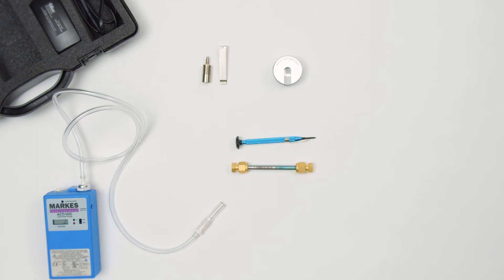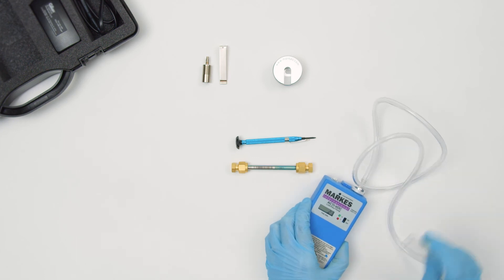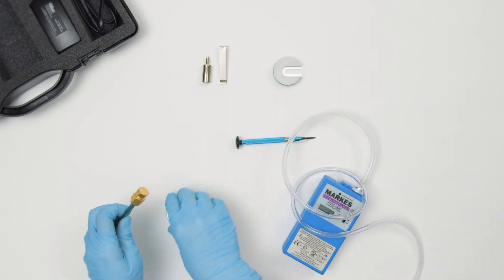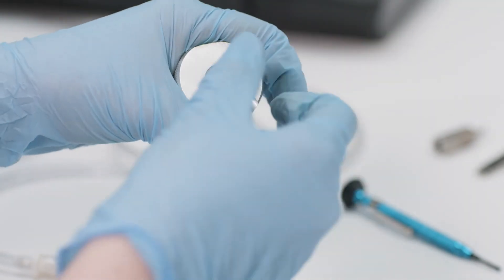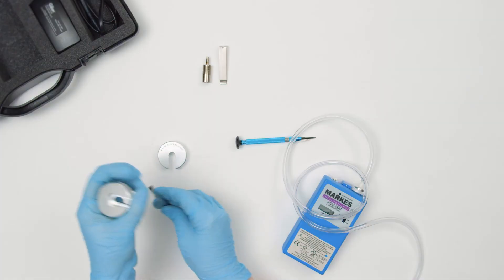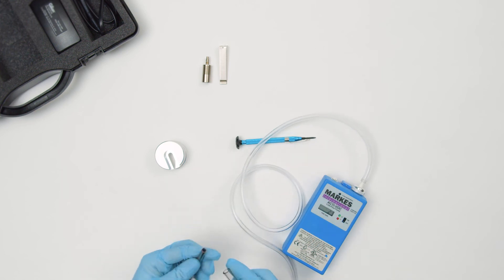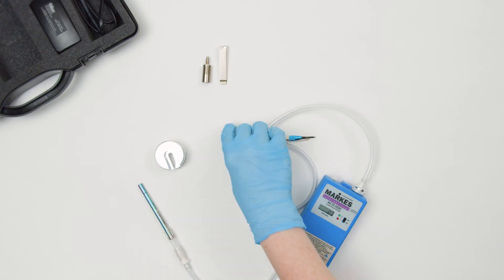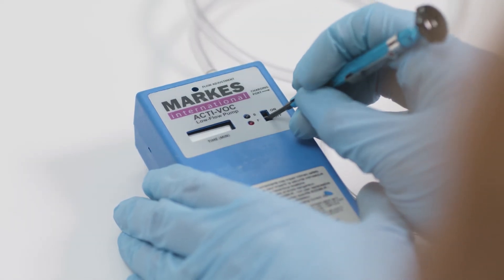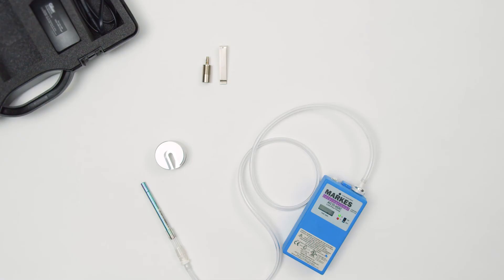To sample, place the pump on a level surface in the atmosphere of interest. Remove the long-term storage caps from the conditioned sorbent tube using the cap lock tool, and push into the tubing adapter with the sampling arrow pointing towards the pump. Turn on the pump using the flat bladed screwdriver and leave to sample for a given time. Be aware that different analytes will have different retention volumes on a given sorbent.